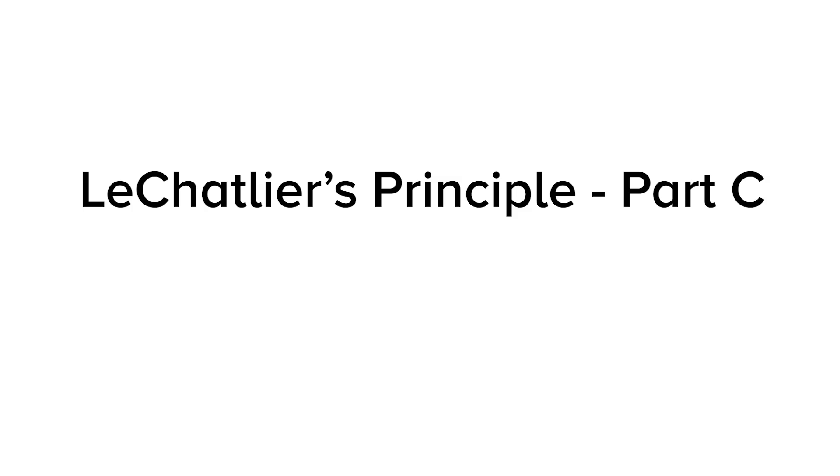This is part C of the Le Chatelier's Principle. We're going to look at the equilibrium between iron and the iron thiocyanate complex iron.